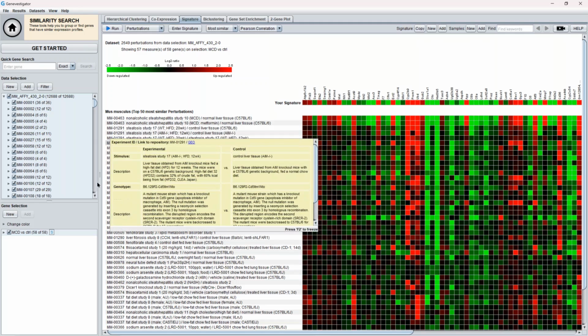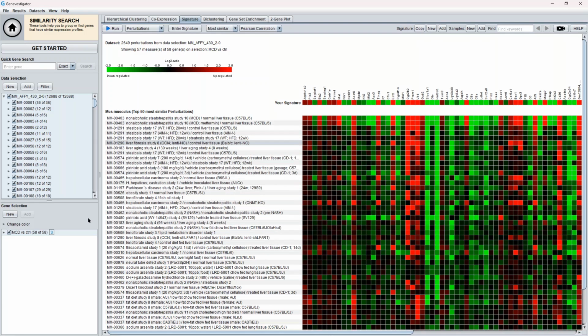Since we see many NASH-related dietary models, it means that we could identify several comparison sets that give a similar response to the dataset that we previously explored in Qlucore's Omics Explorer. So this represents one way to verify your results, because you can identify several other studies than your own dataset in which a similar pattern of differential expression for a set of genes exists.